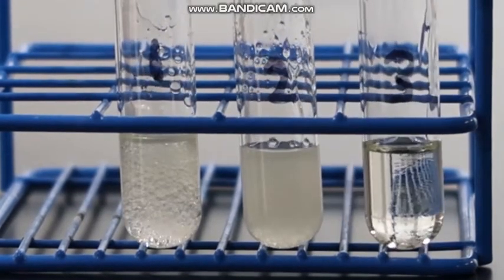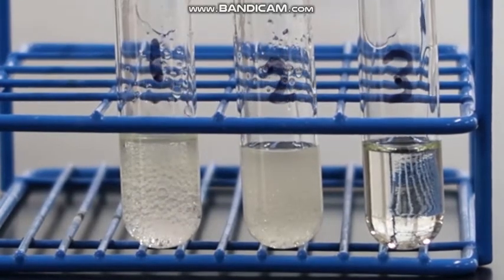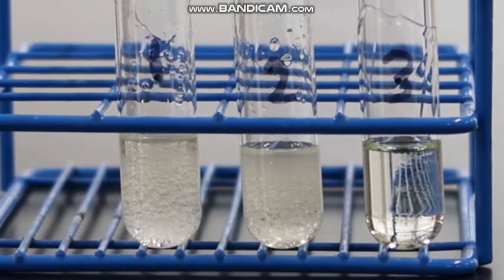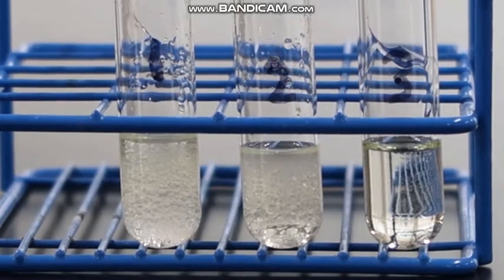As the solutions settle, let me remind you that again, in test tube 1 is water and vegetable oil, in test tube 2 is ethanol and vegetable oil, and in test tube 3 is hexanes and vegetable oil.